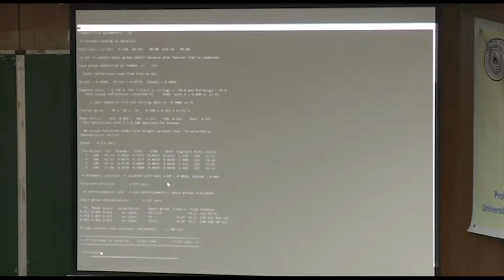Okay, so it outputs, here you can see 3 possible space groups. Can you see it? Is it clear enough? It's kind of hard to see, I guess. Okay, P2 1 over n, however, is the favored one. It's the first one input. And if I want to look at the res file, it's going to be called hk minus a dot res. And then it'll be minus b minus c.